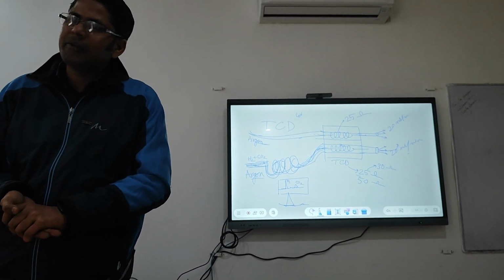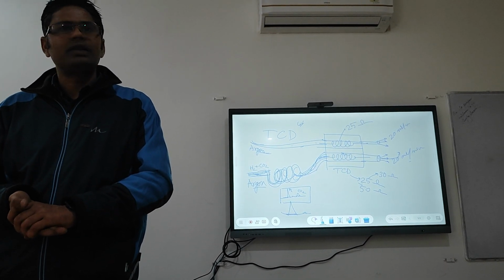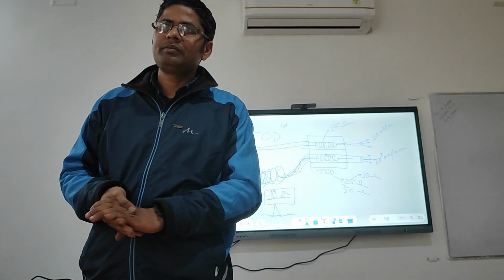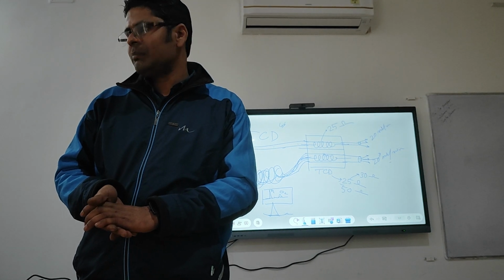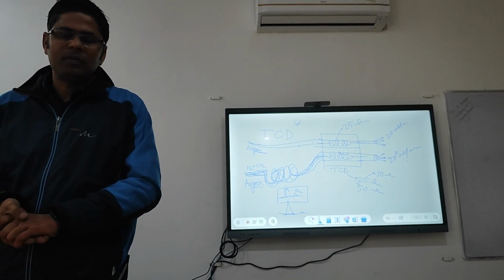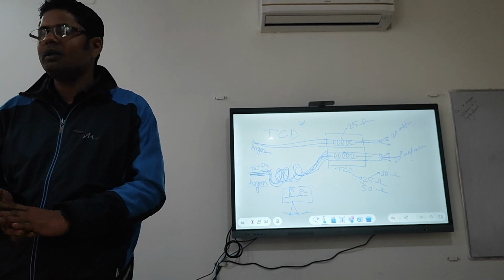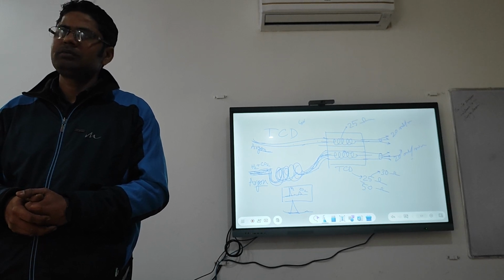At the start, I told you why TCD sensitivity is very low. FID can detect even 0.5 ppm, but in TCD it is at percentage level, 0.5%. It can start from 0.2%. But when we have components that are non-hydrocarbons, and we want to detect hydrogen, what to do? It cannot be detected in FID, so you have to use TCD.